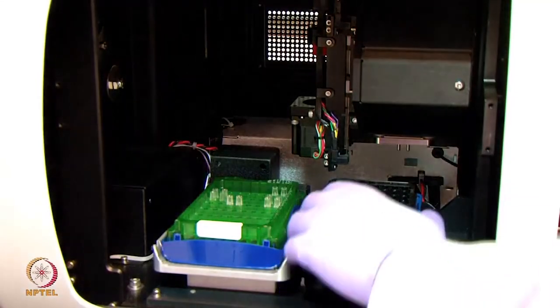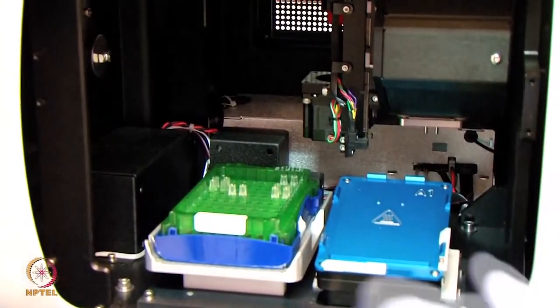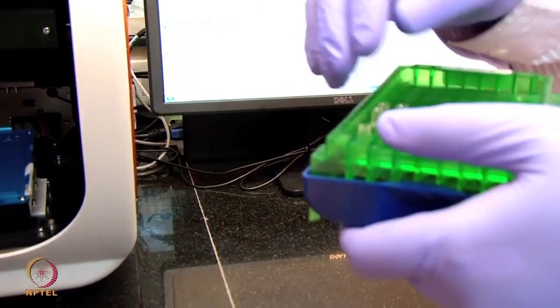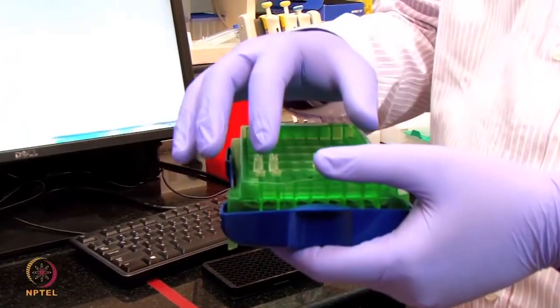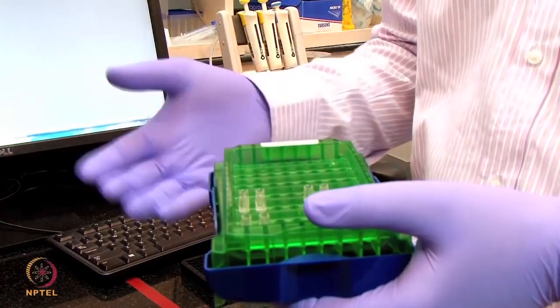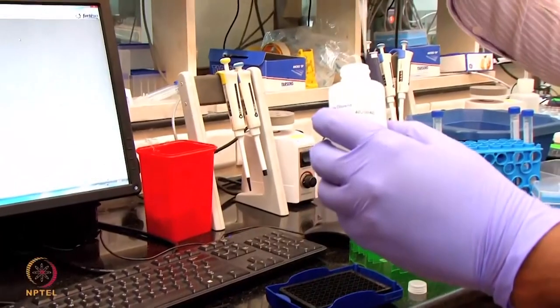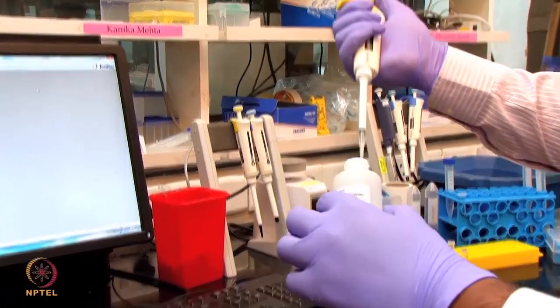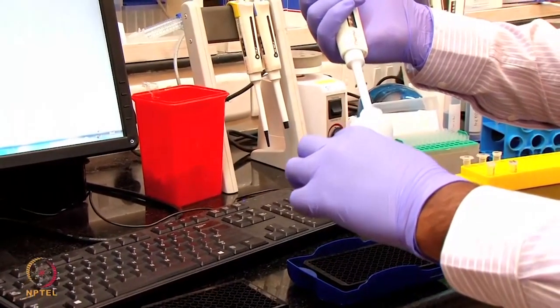Now I'm going to take back this sample plate and also the sensor tray. This sensor is hydrated in the PBS buffer, and our biotinylated antibody is also in the PBS buffer. Now I'm going to equilibrate these sensors with the PBST buffer, the PBS buffer having Tween in it. This PBST buffer we call the sample diluent buffer. Here I'm going to take 200 microliters of this PBST buffer and add it here in A2 and B2.